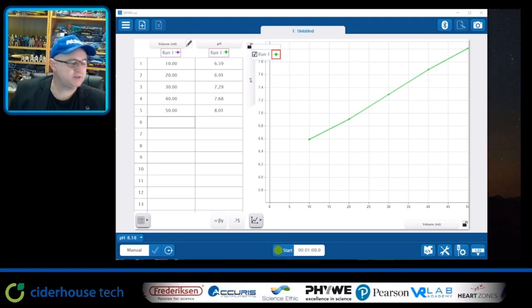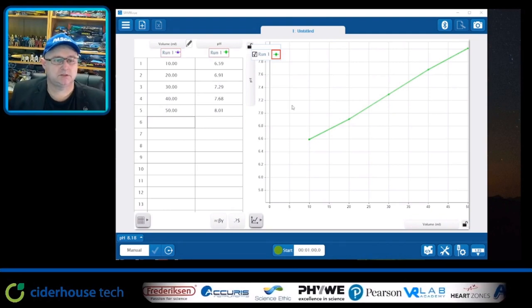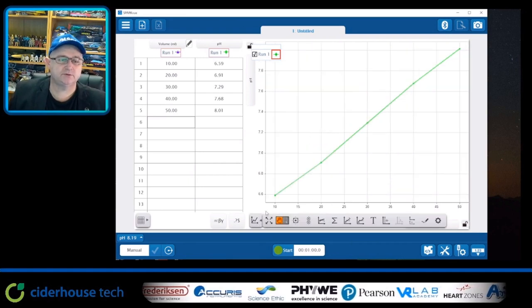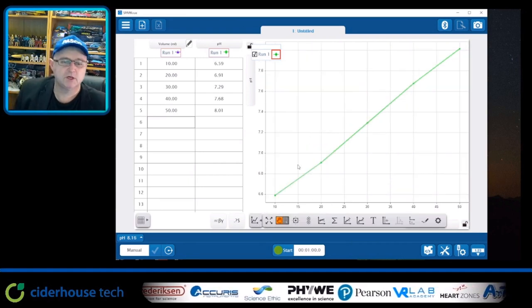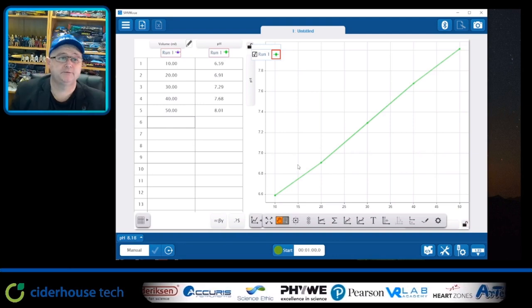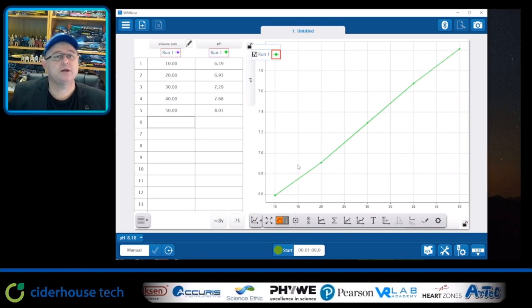Okay, so now we've got the data there. What we're going to do is open up our toolbox, scale to fit. You see there it fits perfectly. So that's a really easy way of doing a titration using manual entry. And that manual entry can be used for so many other things. So keep that one in mind.